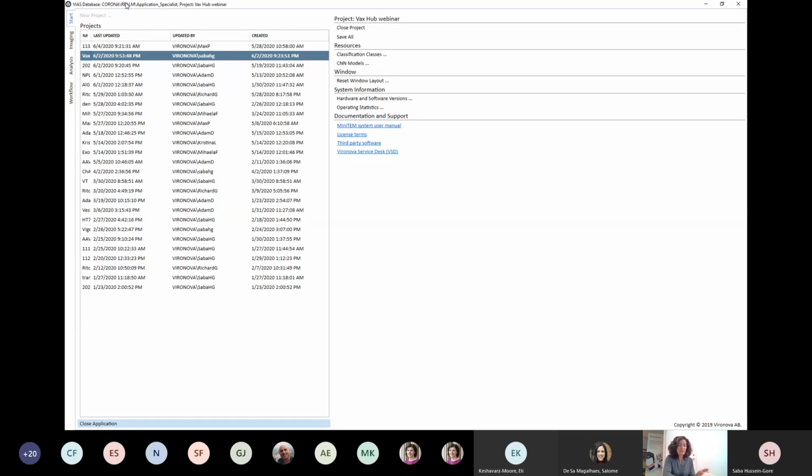So if there weren't any questions, I will get started with the imaging session. I want to just really quickly draw your attention: when we do an imaging session on the MiniTEM, we use something called our imaging session instructions.